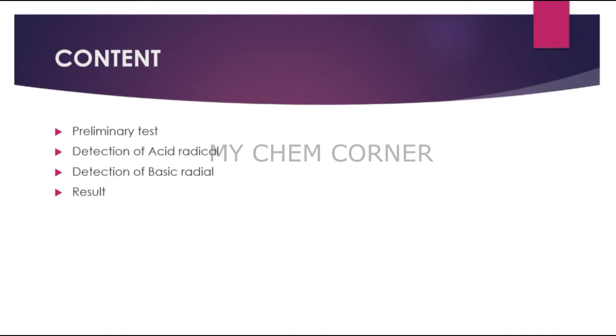Now what is the meaning of a preliminary test? It is when you get your salt, what is it that you observe physically? You're talking about how the salt looks, or the color of the salt. So those come under the preliminary test. Another thing that you will look into under preliminary test is the solubility of the salt. In what solvents can you dissolve your salt to get a homogeneous solution?